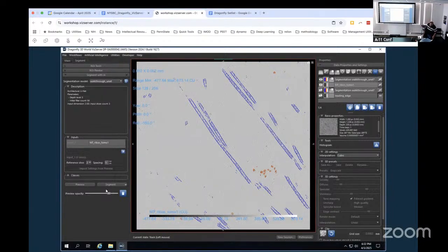Don't worry, we didn't show it any of that. It's never seen carbon before. We only showed it a little piece from over here, and so it's trying to make good sense of it. I could show it a little bit of carbon and teach it to ignore it. That's how you would do that. You would cut out a little piece of carbon and show it, but that's not a microtubule. We'll do some of that.